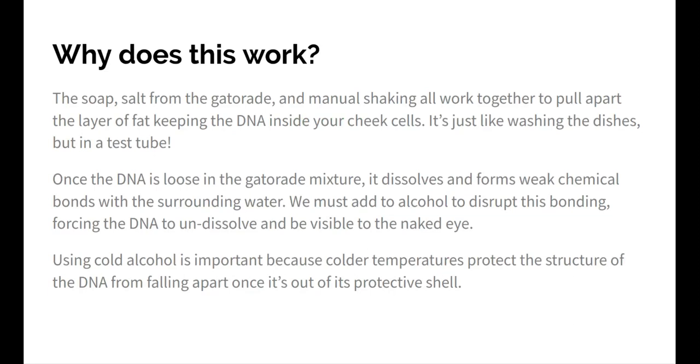So yeah, this works, as I said, because the soap and the salt from the Gatorade and then the manual shaking all work together to pull apart the layer of fat that keeps the DNA inside of your cheek cells. It's exactly like the concept behind using soap to wash dishes. It's just in a test tube and done a little bit more gently. But it's exactly the same chemical process.